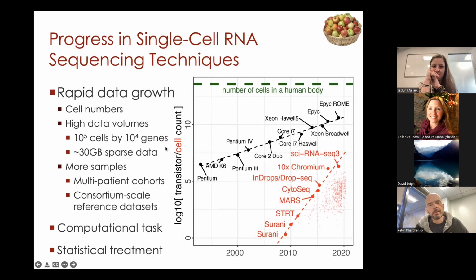So the numbers of cells are growing, and the numbers of experiments people can do, independent conditions or replicates, is growing as well. There are clinically oriented studies with many patients, for instance, being measured. There are also consortium-scale efforts to create atlases, and those can contain millions upon millions of cells.